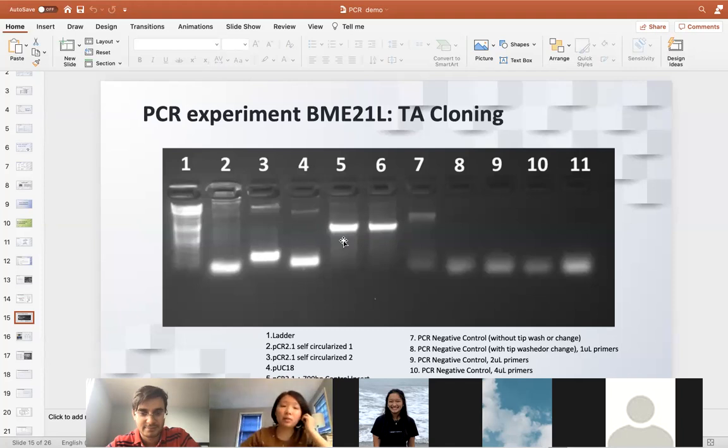So as in they would show up to be the same, so you would know that they were the same thing. What I'm trying to say is that this signal must come from the sequence that you are designing.